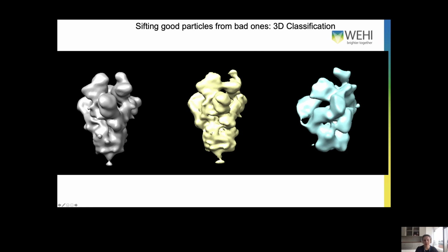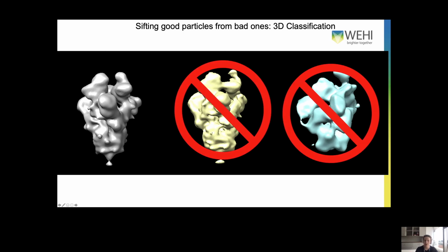For example, here, this is the 3D classification of the SARS-CoV-2 spike nanobody complexes. In that case, I asked whether we can come up with 3 different 3D classes. And this is what happened here. You can straight away see that we have one class that looks very much like what we expect, so it's spike bound to nanobodies. One looks not so good, but still has the overall shape, and some look completely arbitrary. So in this case, I decided that those classes are not good, and this is the class that we should continue with further.